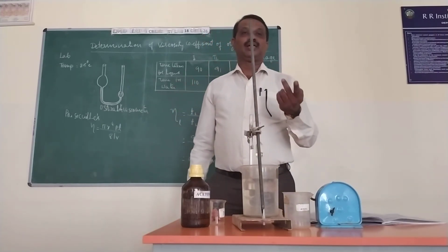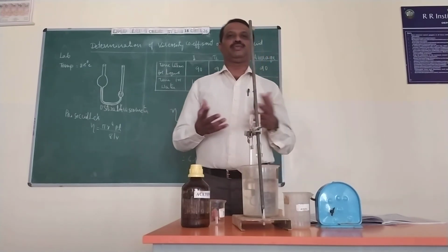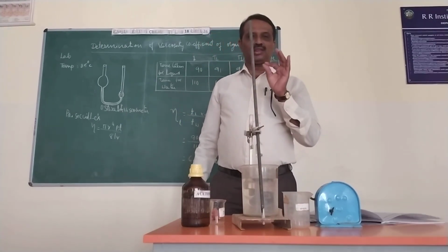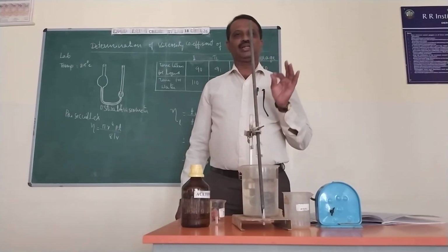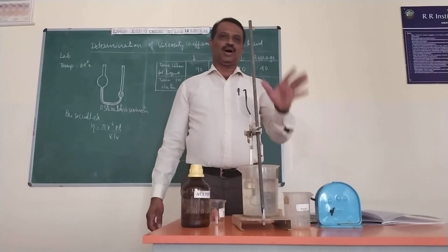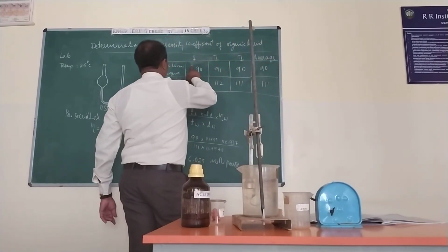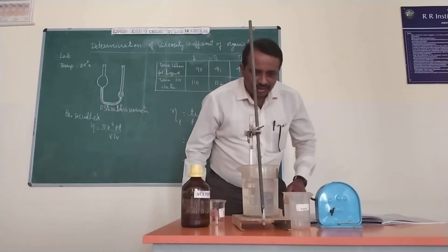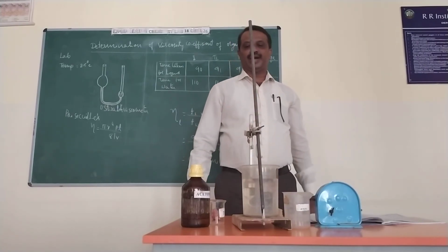So it is no use to find out the viscosity; it wrongly gives the viscosity coefficient. It is far better to use all 3 trials of the same viscometer for the liquid, and all 3 trials of the same viscometer for water also. The first time I got the time taken for the liquid as 90 seconds. The second time is 91 seconds.